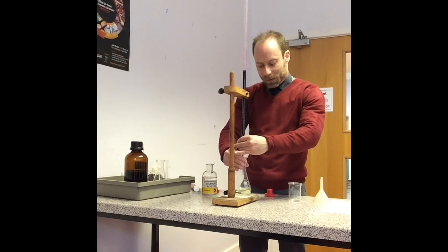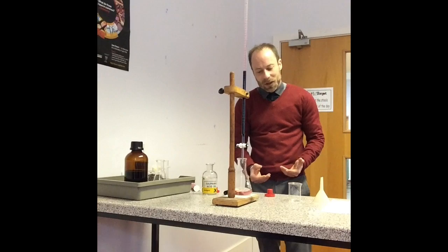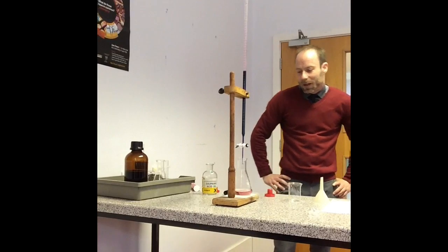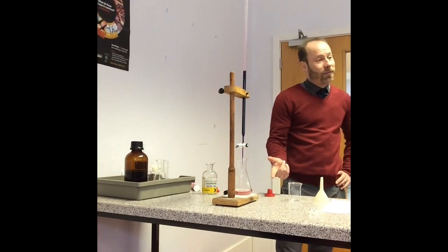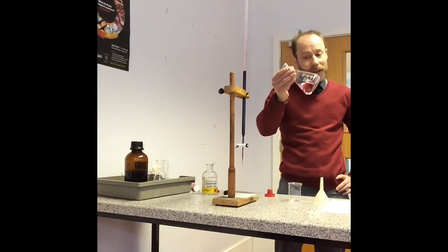Grape juice. Oh, yeah. So that's it, pretty much. If I did that again, I probably added a couple of drops too many. Is it as soon as it goes pink? Yeah, that's it. As soon as you've got that pink colour, it is done.